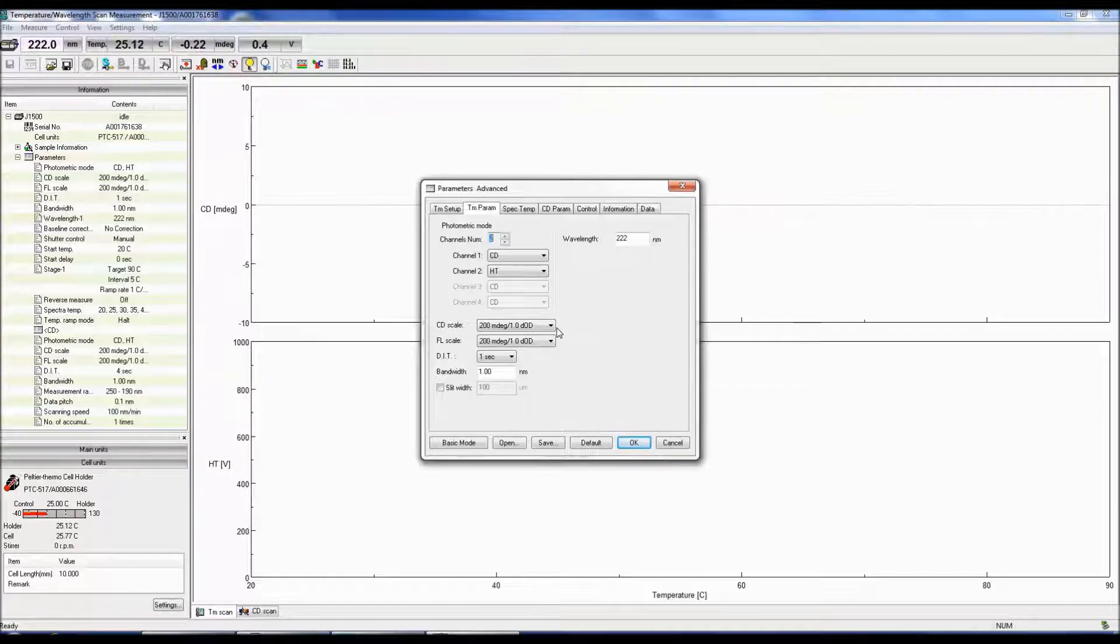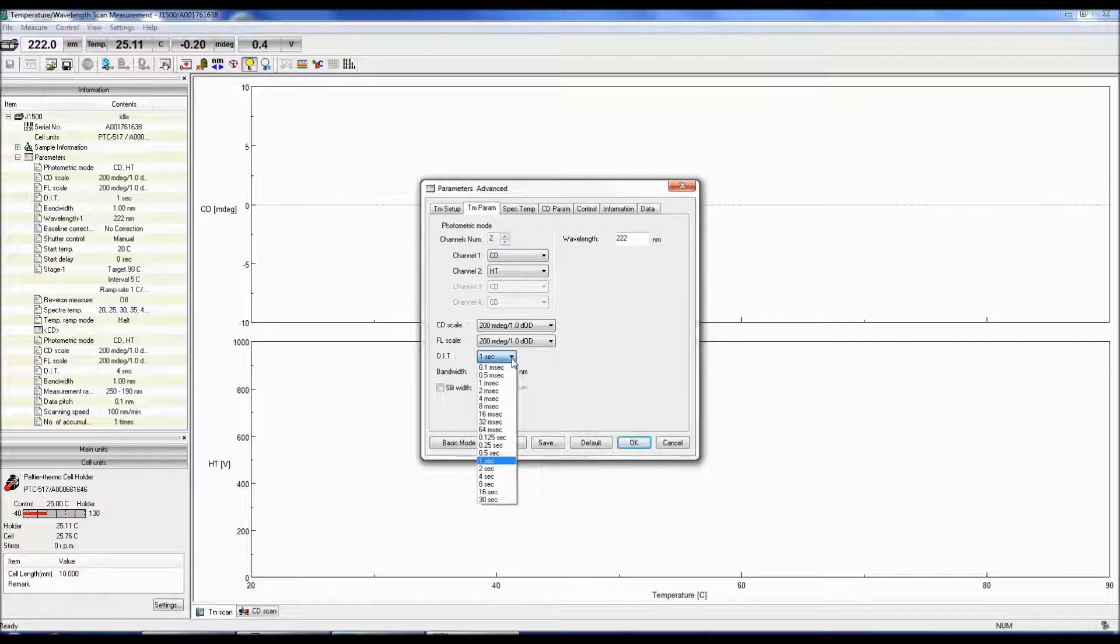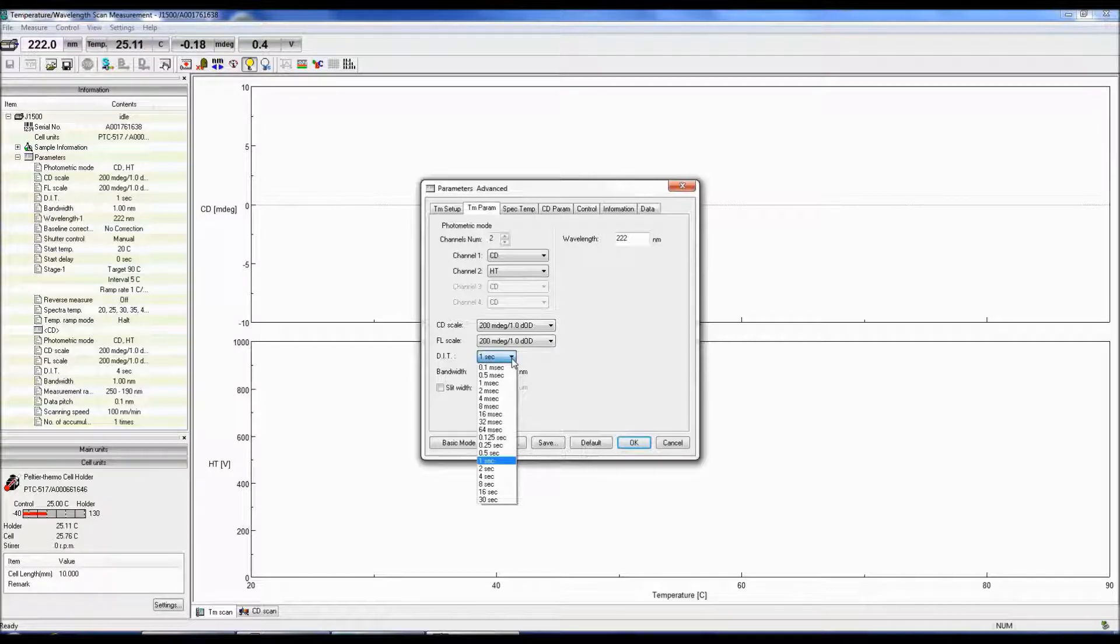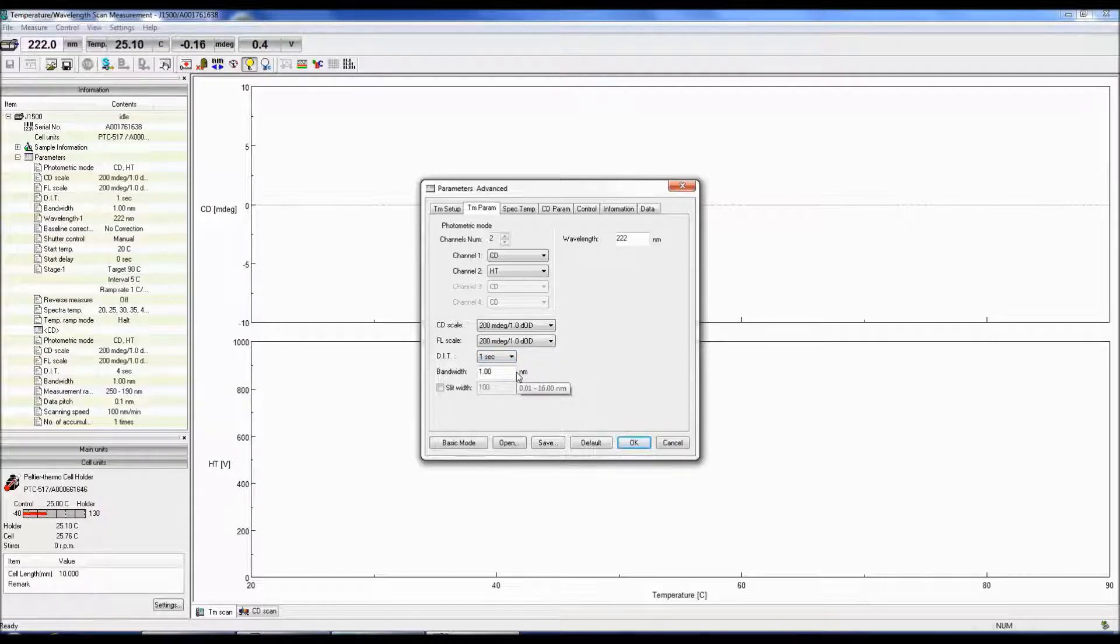The CD scale is the limit at which the CD signal can be obtained. The DIT is the digital integration time or the response time. The longer the integration time, the better the signal to noise. Again, a good starting point for selecting the DIT is 4 seconds.